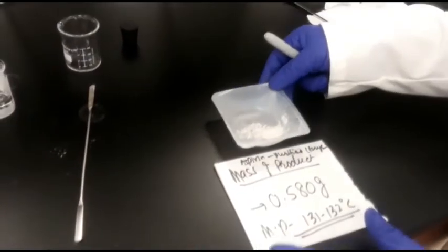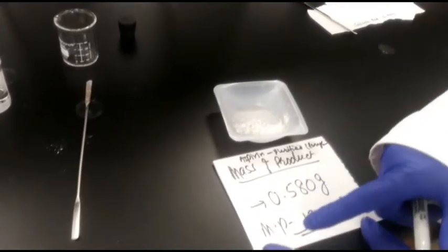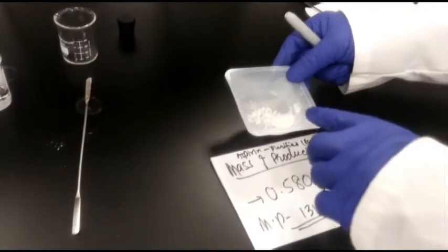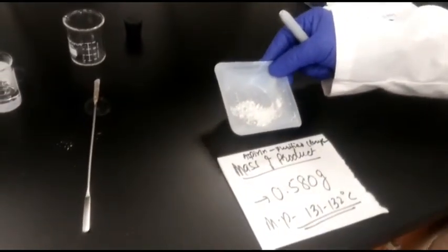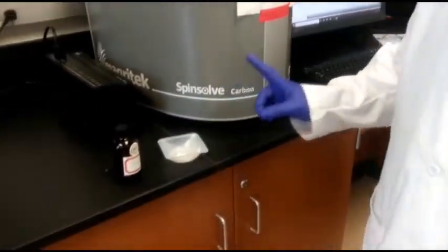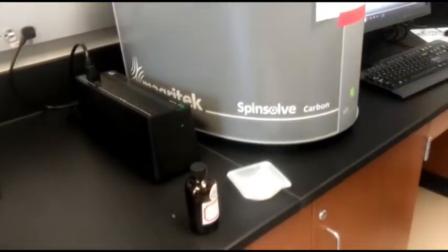Here the product mass is 0.580 gram, and the melting point is 131 to 132 degrees Celsius for this pure, recrystallized acetylsalicylic acid sample. And we needed to characterize that by using the NMR and IR, and we already determined the melting point of that. Now for NMR, I already prepared the sample there in CDCl3.